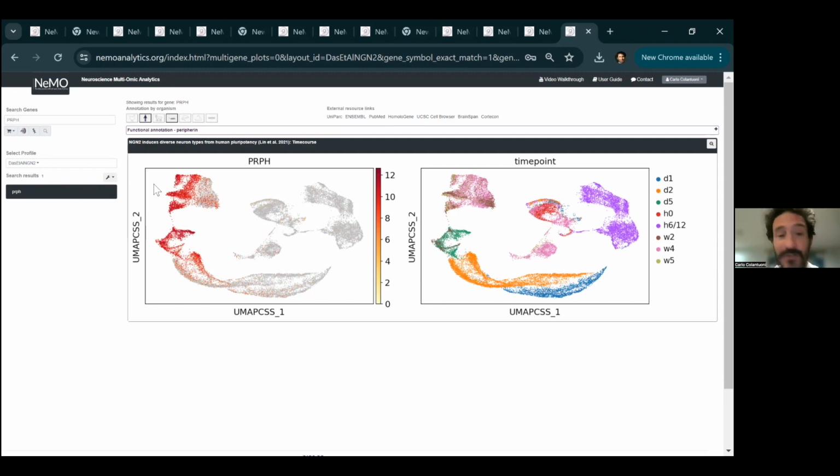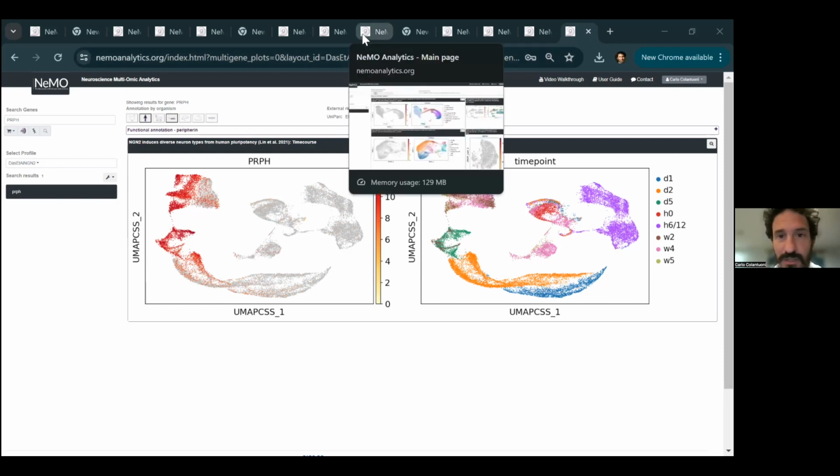So if people have questions, please ask. If you want to look at particular things, please ask. But I'm just going to walk through and give you a tour of what we can do if we begin to get all of our data in a common space. So for instance, if we had the morphogen gradients and then the NGN2 and morphogen dosing experiments in the same place with that in vivo data, for instance, the Braun atlas we have in this environment too, what other things we could do. So maybe let me start here.